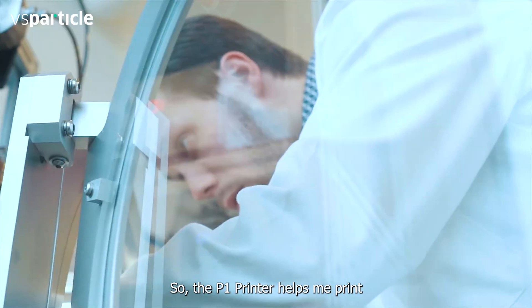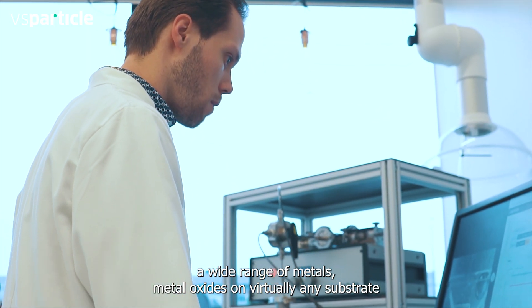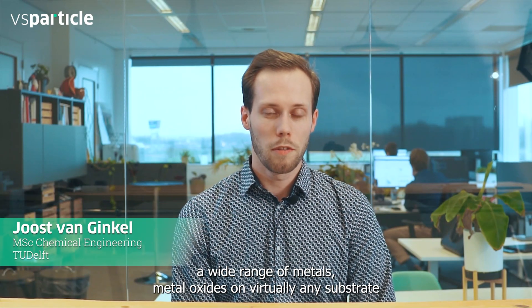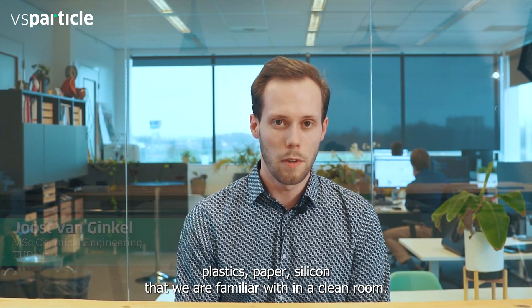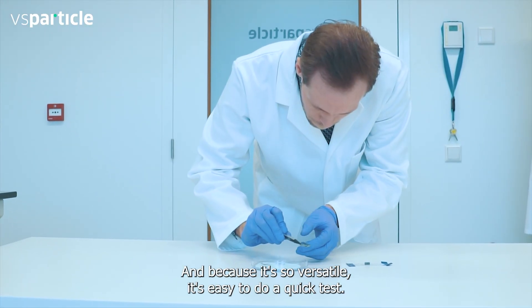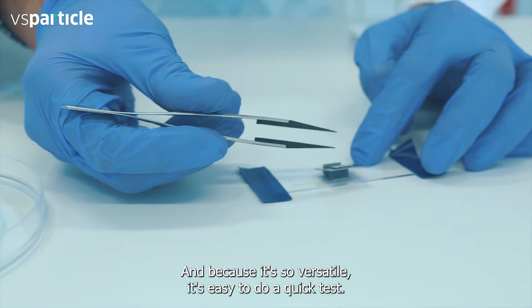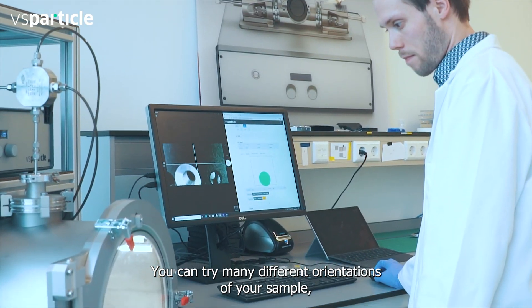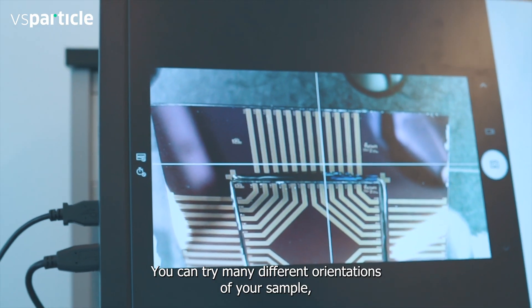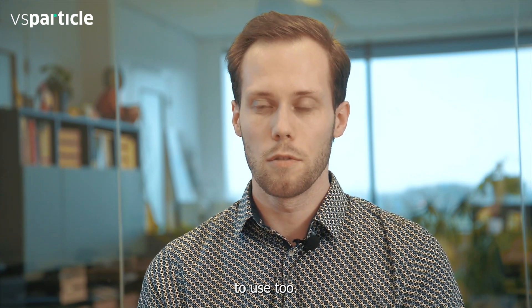The P1 printer helps me print a wide range of metals and metal oxides on virtually any substrate — plastics, paper, silicon that we are familiar with in our clean room. Because it's so versatile it's easy to do a quick test, a collaboration, you can try many different orientations of your sample and many recipes, which makes it a flexible and easy to use tool.